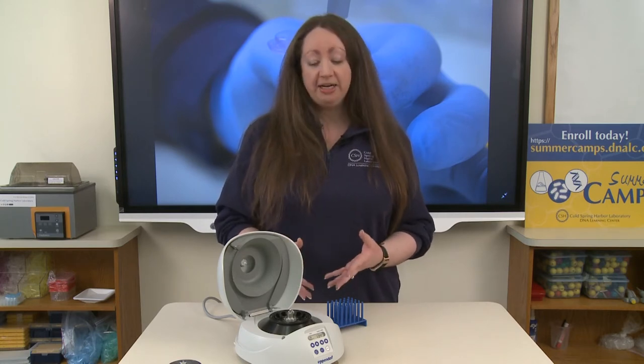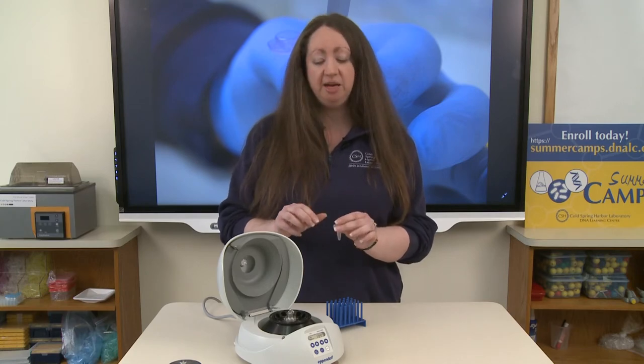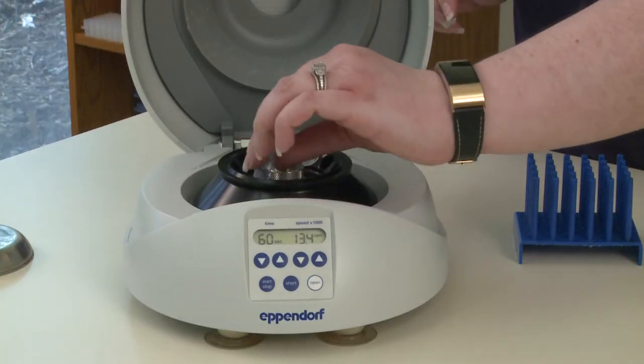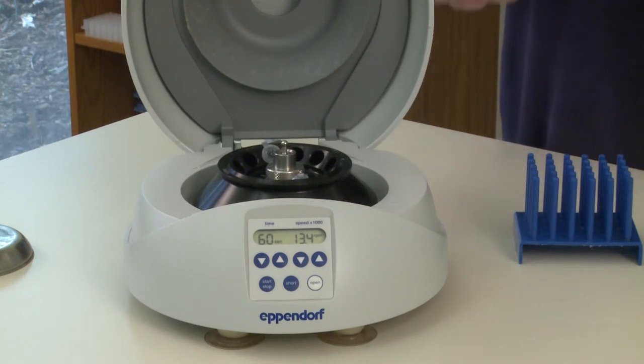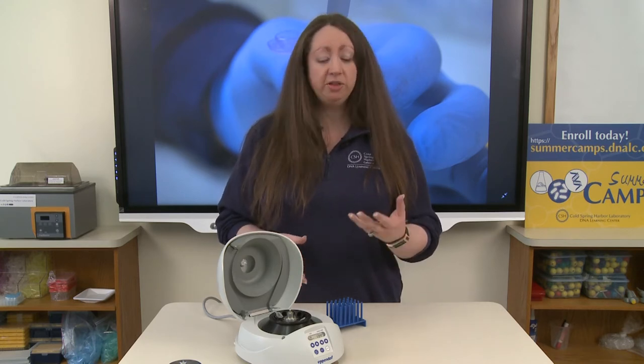To prevent that, we balance our centrifuge by putting another tube of the same size and same volume of liquid inside of our rotor. This is now a balanced rotor. We can put an even number of tubes in here — we can fill the entire rotor or we can put three tubes in here, which would be an equilateral triangle. Just make sure that your rotor is balanced before you begin spinning.